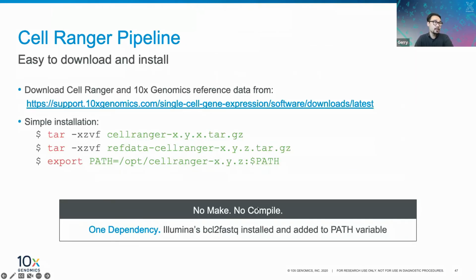Downloading Cell Ranger is very easy. There's a set of instructions on this link here. Again, I will send these slides to you so you can look at them and download it yourself, and the installation is quite easy as well.